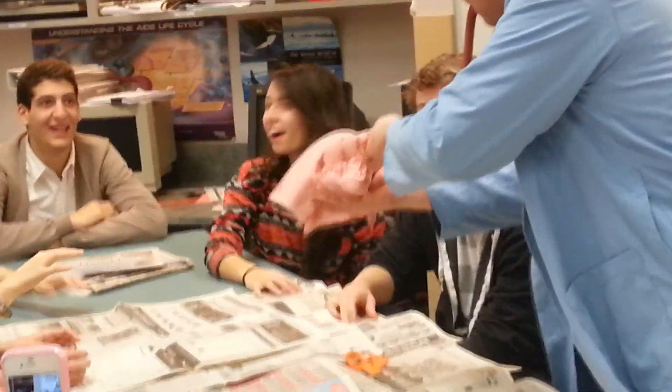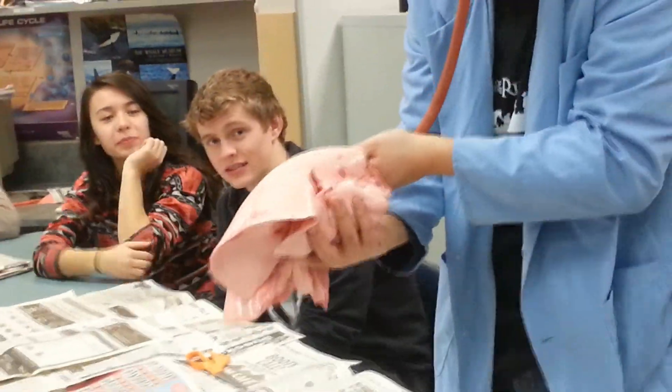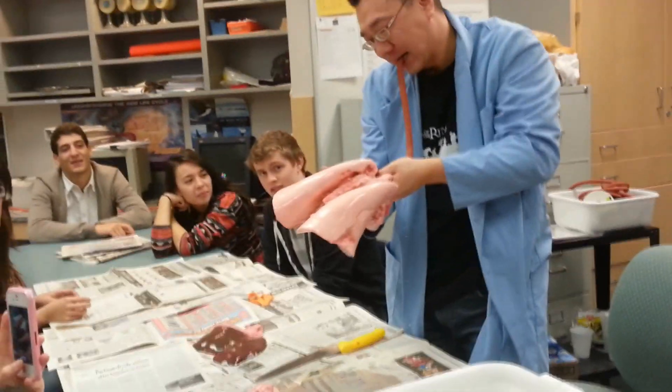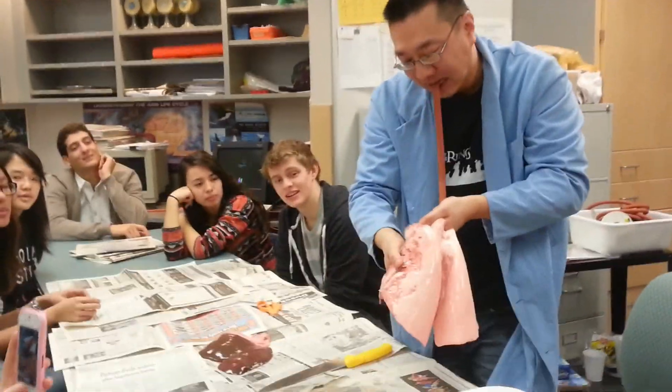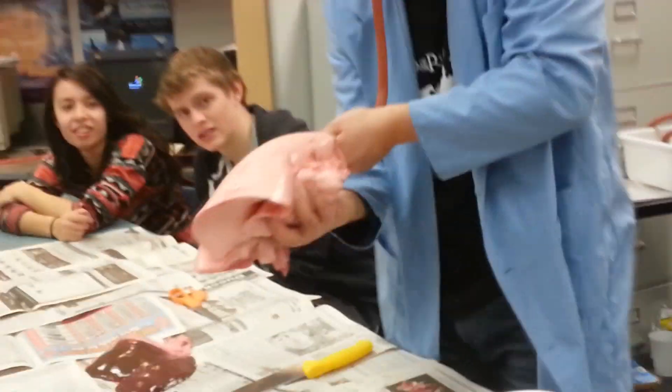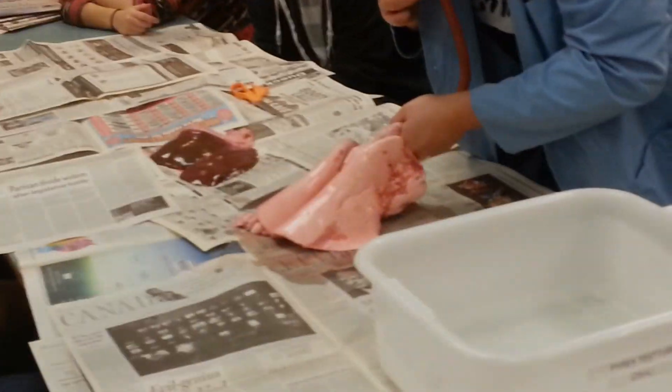Let's watch your esophagus back. Okay, so nice and fluffy, huh? There's some damage here, so that would not be good if that was you. It's nice and fluffy. Smells like the farm.